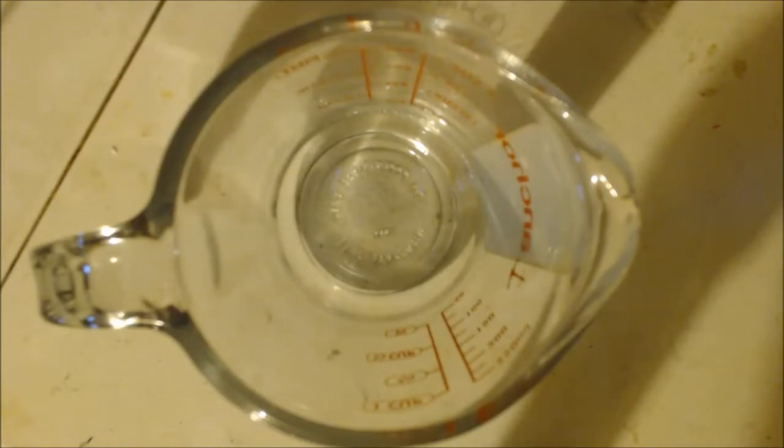All right, now I distilled more of that out from the last video, so I have more than 8 milliliters. I distilled out a whole bunch to make sure that I got it all, so I want to get a good yield for this.